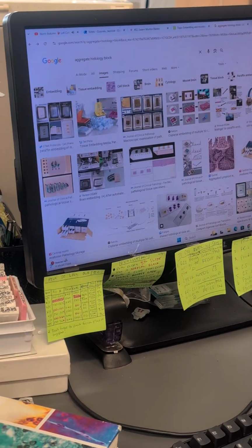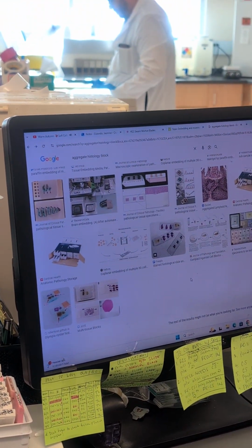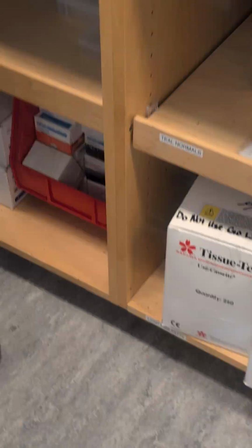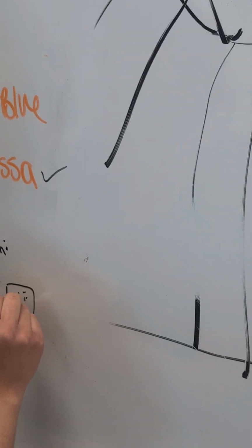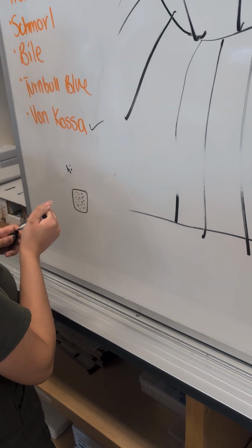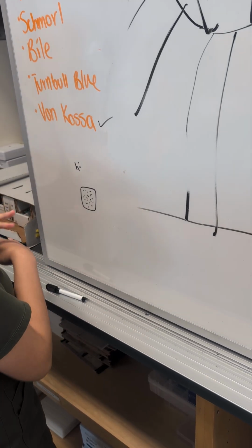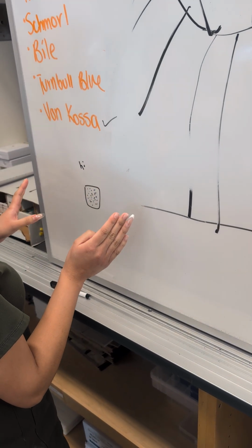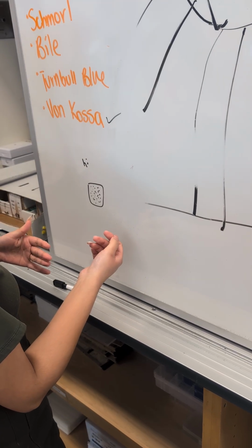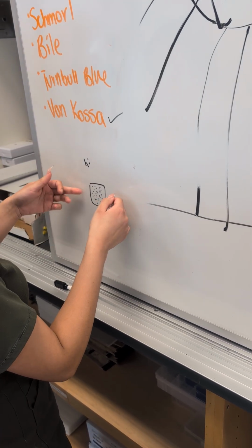But essentially, it's going to be all the tissue really, really tiny. So I'm just going to draw a picture on the board instead. What it would look like is, here's your block like this, and the tissue is just everywhere. A bunch of free floating pieces of tissue, because it's literally just a cluster of the cells that they could collect there. You typically will see it with the cervix, but sometimes you can also get skin as well.